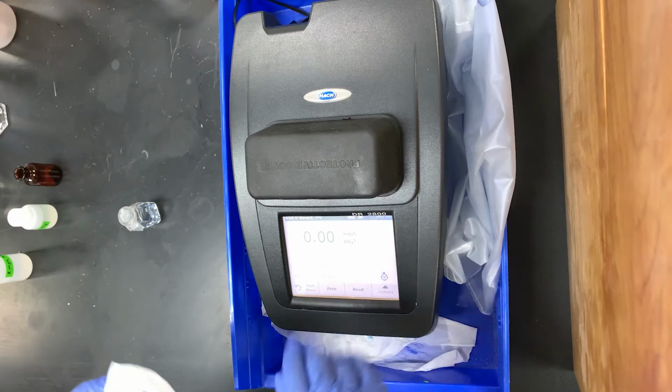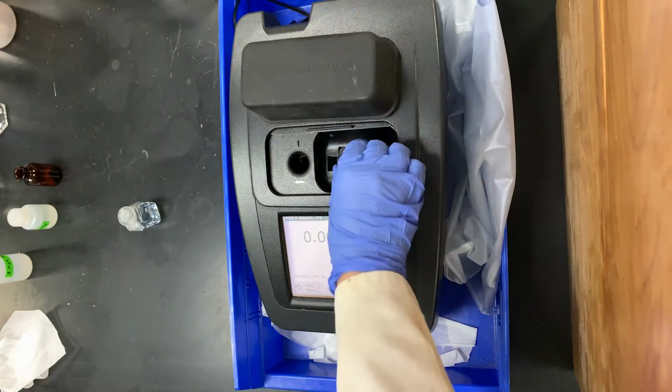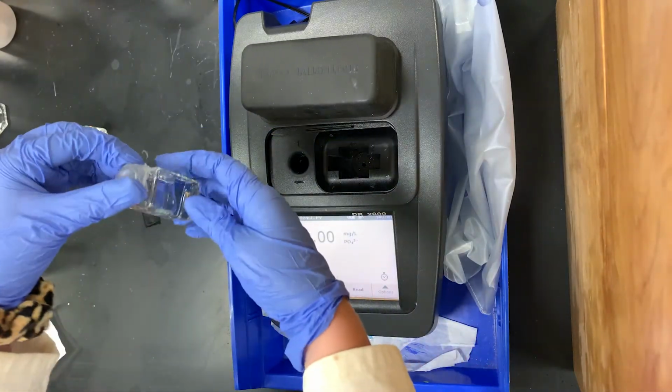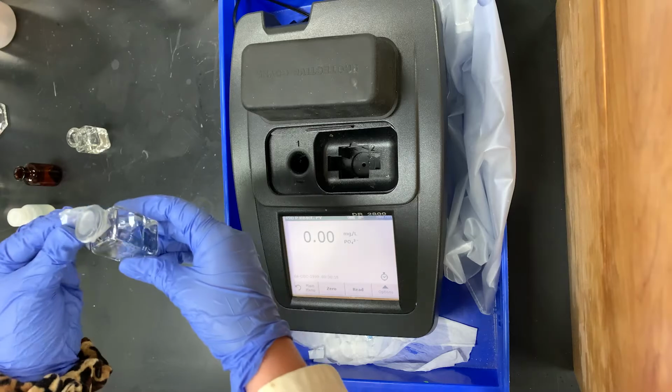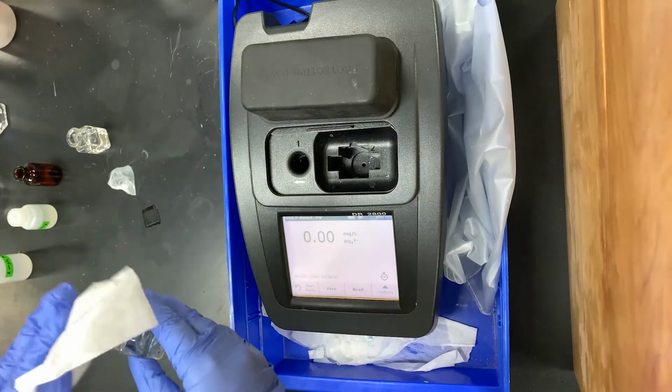For this method, each new solution that you're analyzing has its own blank, and the blank will always just be 10 mils of your sample with no reagent added. Now that our blank is done, we can put our sample in, and it is a bit blue. I hope you guys can see that, it's just not my gloves.